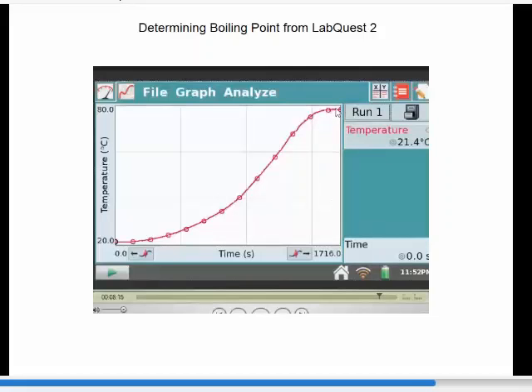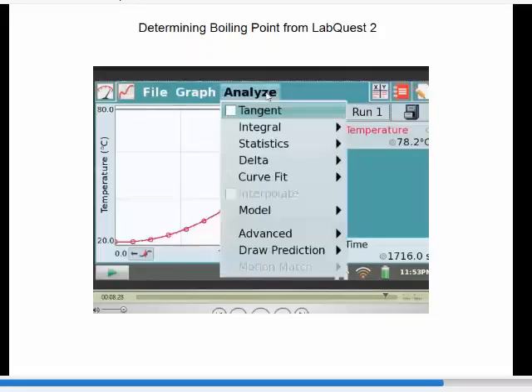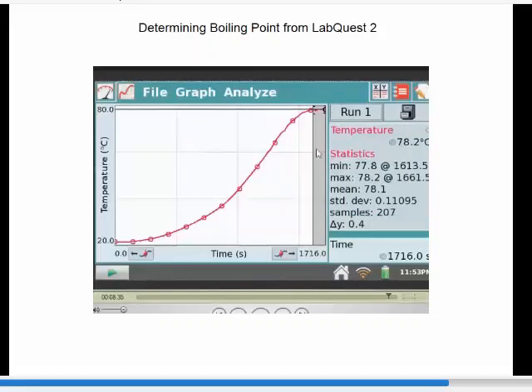When I stop the run, what I want to do is I want to figure out what the boiling point is. What I want to do is I want to analyze this little section of the curve up here. If I want to draw the averaging, I can just put the mouse down and drag it over here. Tell it I want to analyze the statistics for this, which means I want to know what the temperature is at that point. 78.2 is the average, the standard deviation is like plus or minus a tenth. So we're pretty sure that our boiling point is on the order of 78.2 degrees. And so that's an example of how you would find a boiling point for these materials in this experiment.